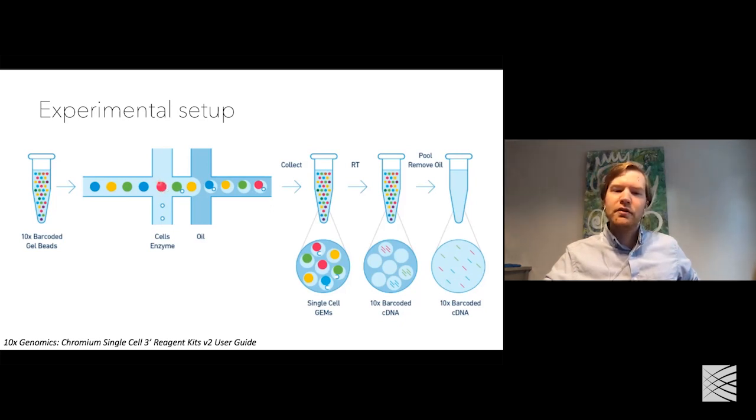So millions of pieces of DNA here. All of those pieces have the same droplet barcode, and they have a random UMI sequence. So what it actually looks like is 16 bases define the droplet barcode, and the following 10 or 12 bases define the UMI. And that UMI is totally random sequence.